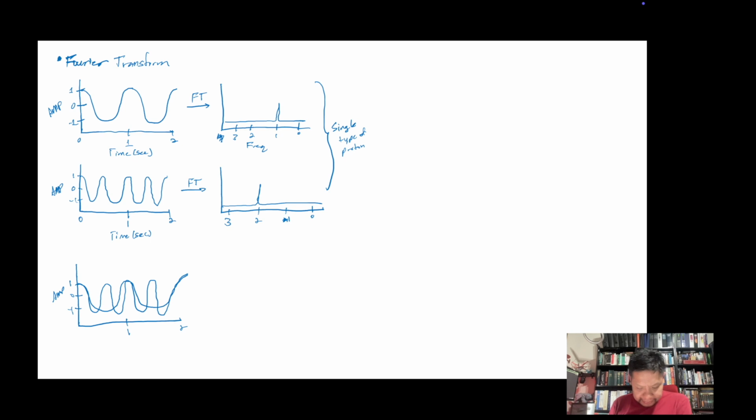All right. And so that's essentially what that would look like. I'm sorry, it should be more straight down there. Right, the amplitude should remain constant with both waves, but I apologize. So what will happen then is that you have now two waves overlapping each other, right? And if you recall back from the very first or second lecture, I was talking about the superposition of waves. Remember that? They sum up.